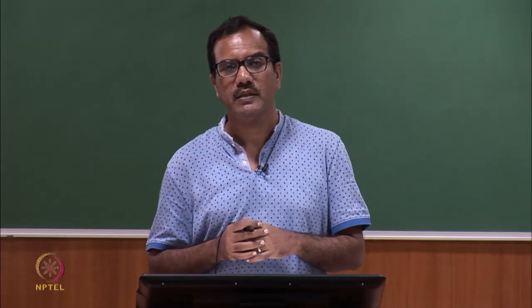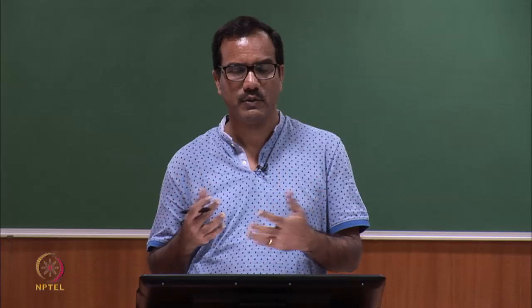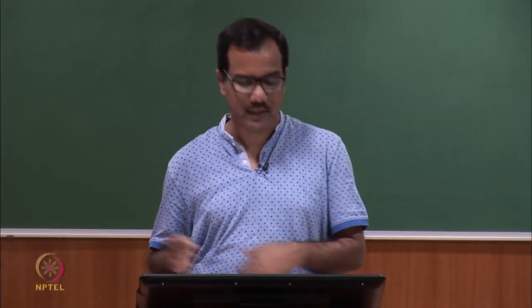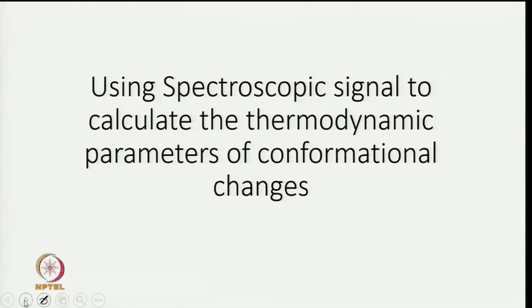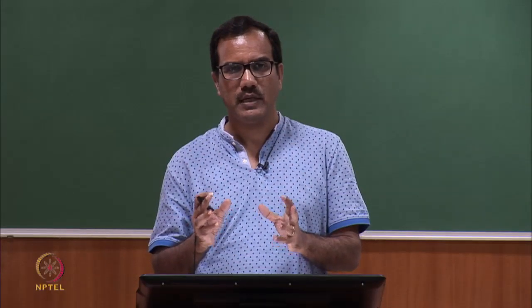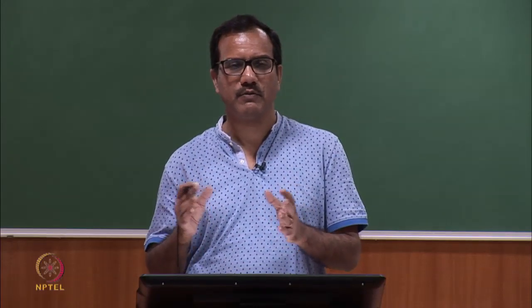I will start with the application of steady state fluorescence measurement, and then I will go to time resolved fluorescence. There I will discuss how time resolved fluorescence is measured and then what the applications are. So, let us first look at the applications of your steady state fluorescence measurement. One of the very important applications is to look at thermodynamic parameters of conformational changes.